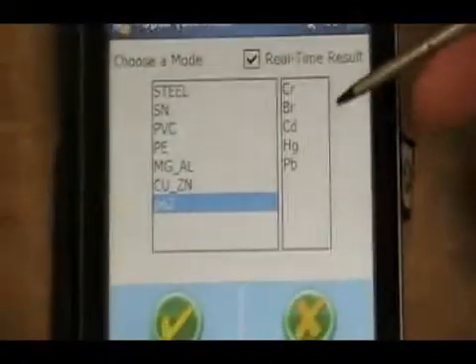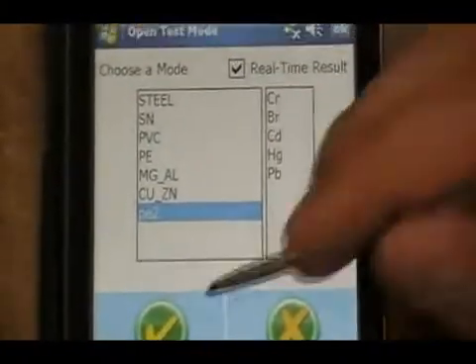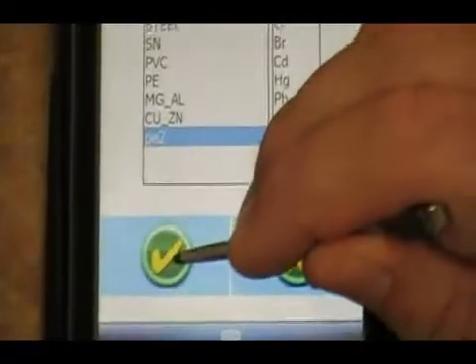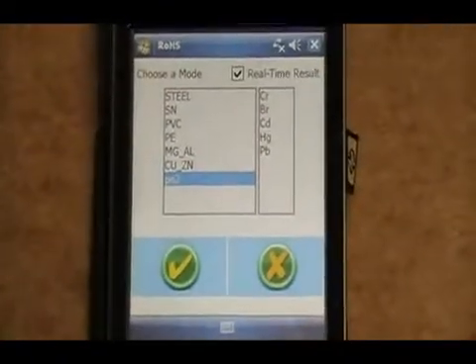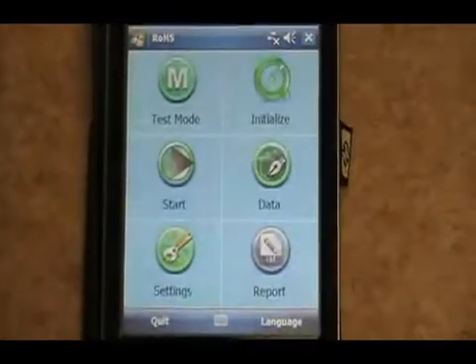So you first highlight the PE2, then hit the check mark, and it will load into the program.